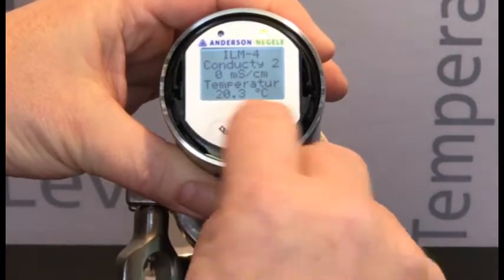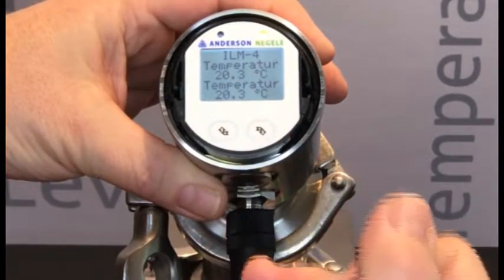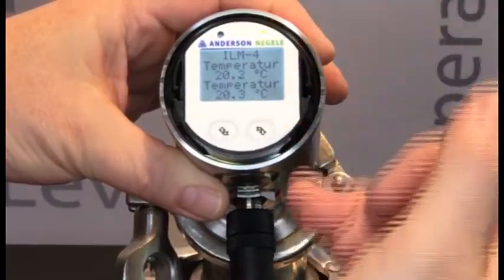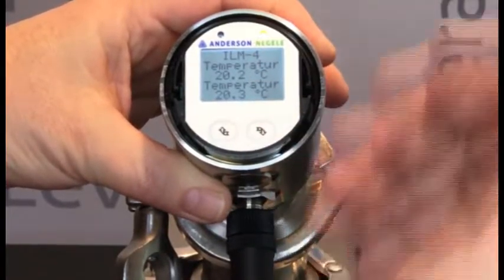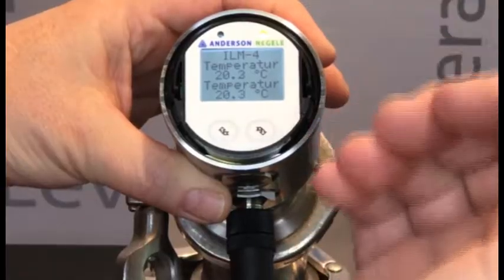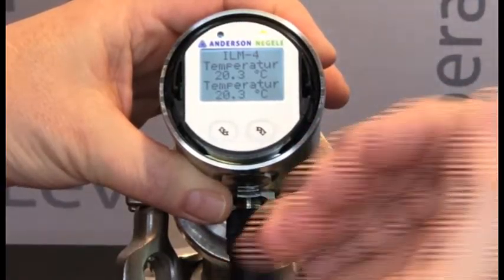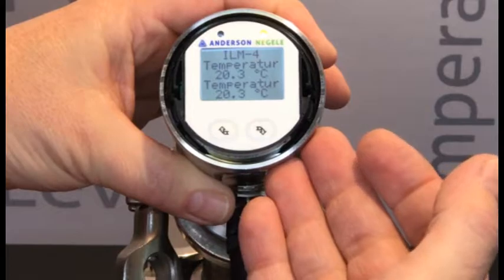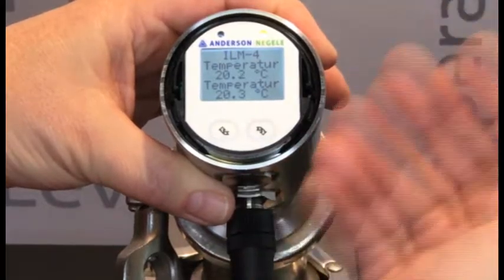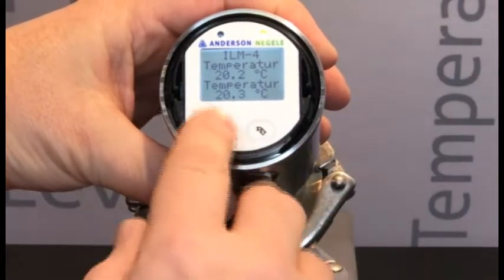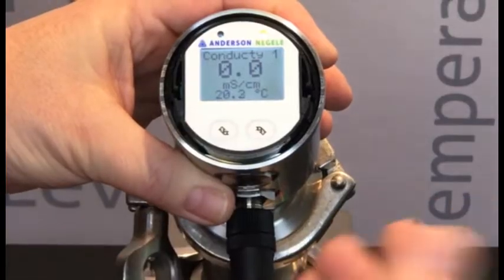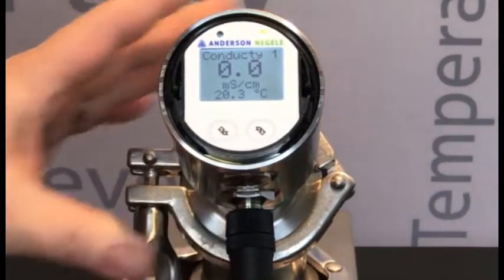One additional short push takes us to the temperature screen. So what we now have is the temperature replicated on both displays, and we've scrolled through all of the process variable choices for the ILM-4 that can be assigned to the analog outputs. To return back to the main screen, a long press of the left button takes us back to that initial menu.